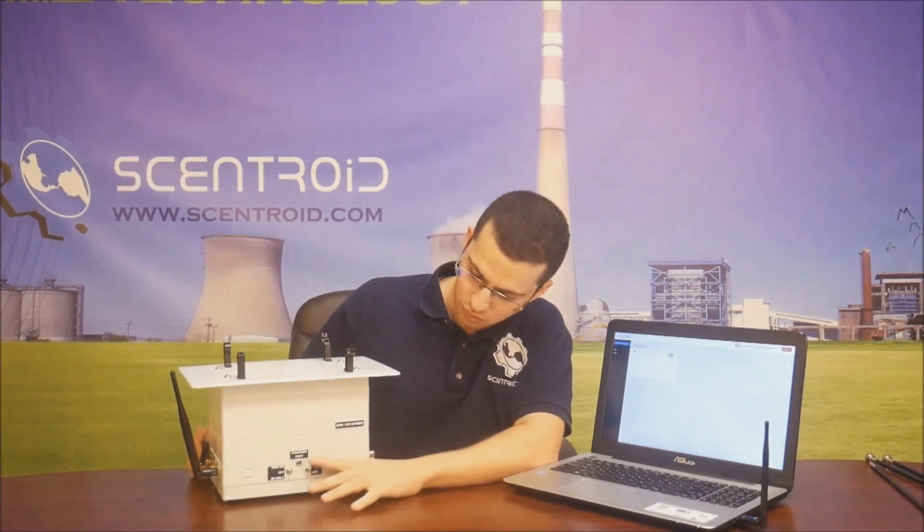And then when you're ready, you're going to want to turn your DR1000 on. Before actually using your DR1000, we recommend you keep it on for at least 2 hours so that the sensors are warmed up and can give you accurate results.